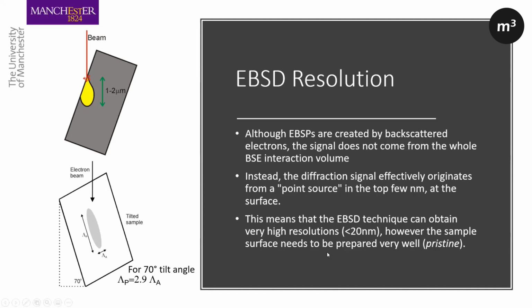This is a disadvantage, but the advantage is, of course, that you get higher backscatter coefficient, and also because you've tilted, your signal is coming from the top surface, so your resolution depth-wise improves, but in Y it reduces. So there are advantages and disadvantages, and it's up to you to judge which is more important when you're doing your analysis, whether tilting a little bit less might be better to resolve the resolution in Y or not.